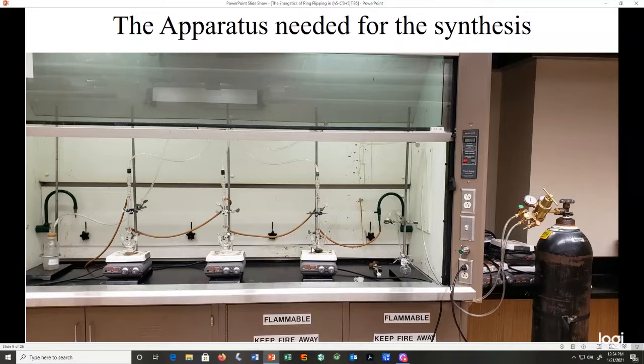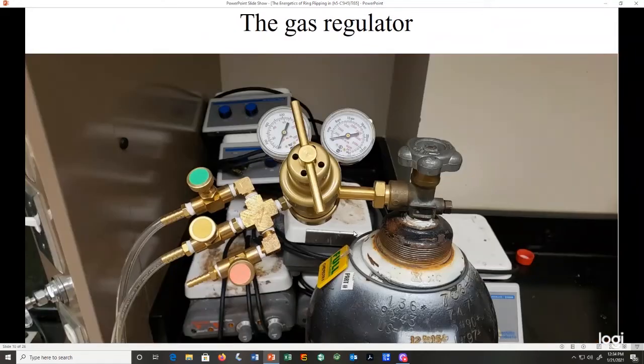And we have our actual reaction flasks and condenser columns. We have a water cooling system that we can apply to those condenser columns. And then we have our gas bubbler here. And let's look at each one of these individually.